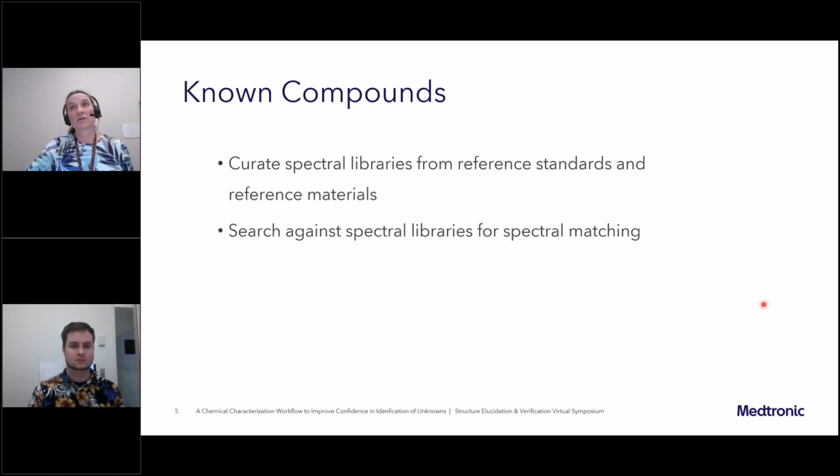The reference materials can also be unsterilized, sterilized by different techniques. We do have libraries for all of those. And we are also going to expand those reference materials to be undergoing aging and degradation studies. So by creating these spectral libraries, we are going to search against those spectral libraries.